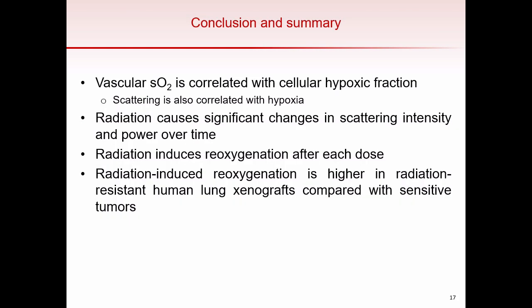So in summary, we validated the sensitivity of diffuse reflectance spectroscopy with an established method and proved that SO2 is correlated with hypoxic fraction, and interestingly, scattering is positively correlated with hypoxia.